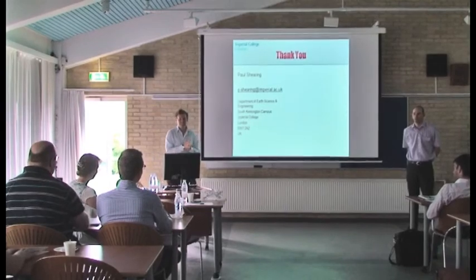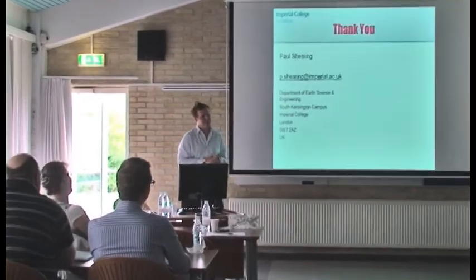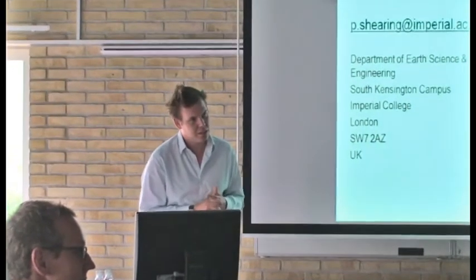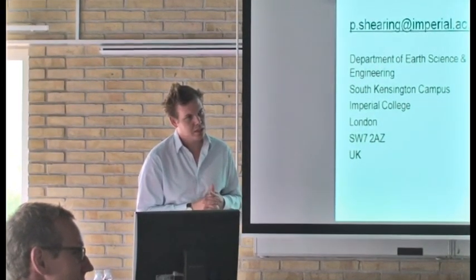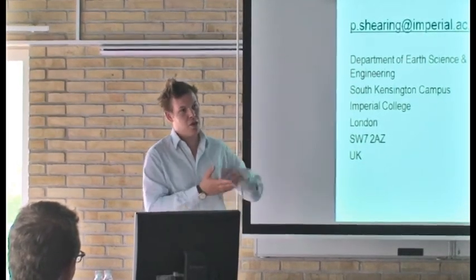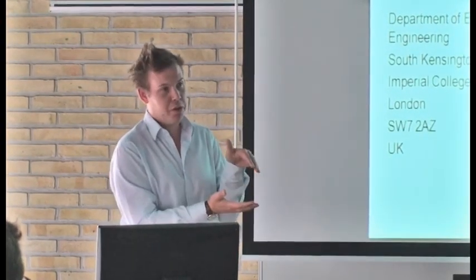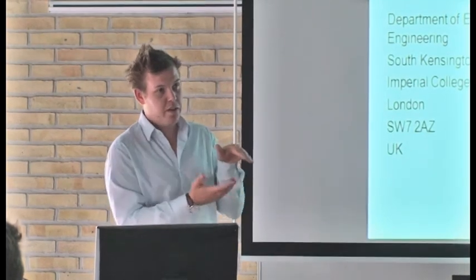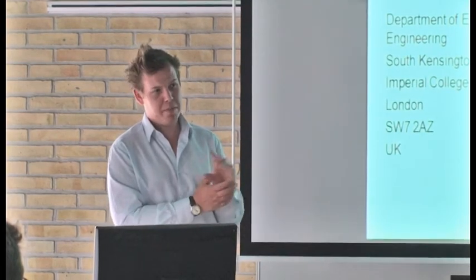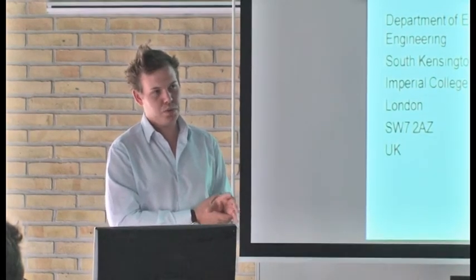So we know there's no localized heating from the X-rays. I don't know how you get migration induced by the X-ray. It's not something I thought about, but I just know a synchrotron source is incredibly intense. Yeah, sure. Well, obviously, because you get a lot of flux, but actually quite a low energy. It's because there's a crystal monochromator that we can tune the energy very exactly around this nickel edge, as I mentioned. So whilst there is a lot of flux, it is quite a low energy, about 8 keV, so an order of magnitude at least below most lab sources.